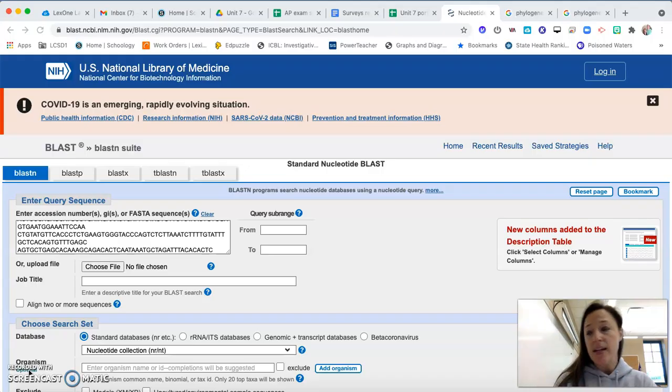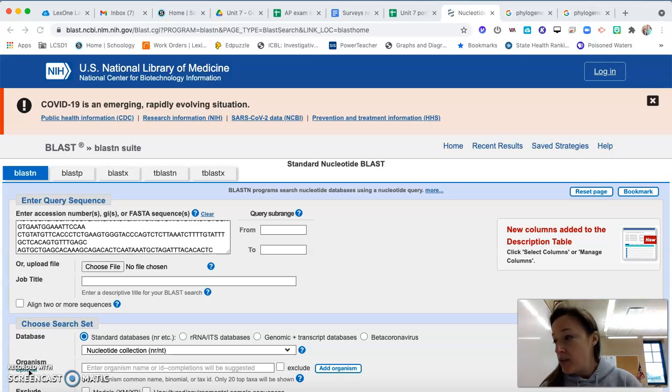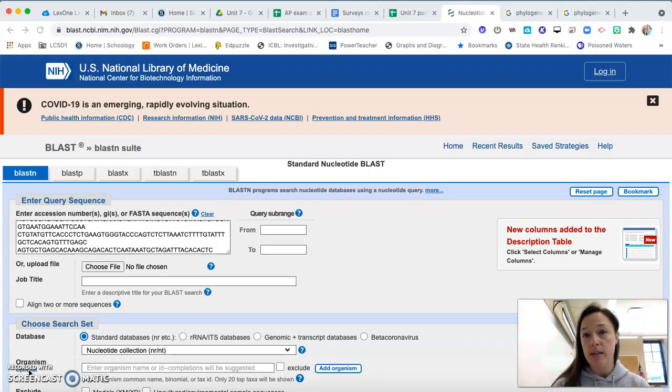All right, and that last one was really what you did with your protein. So you were given a protein, you had to get the sequence for it, blast it, and all that kind of stuff, and then you analyzed an evolutionary relationship based on the genetic similarity. So when it says, I can use cladograms and bioinformatics to ask other questions and test my ability to apply these concepts to answer those questions using genetics and evolution, the genetics is that percent similarity. I think it's called the query cover. And then the evolution is the cladogram.